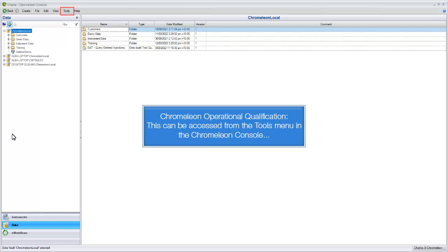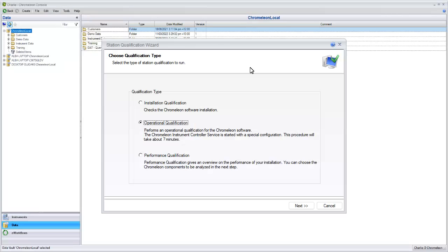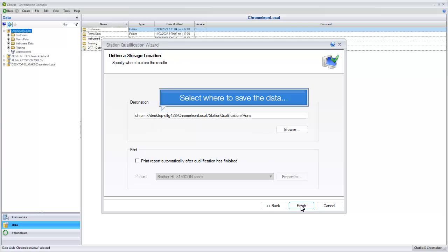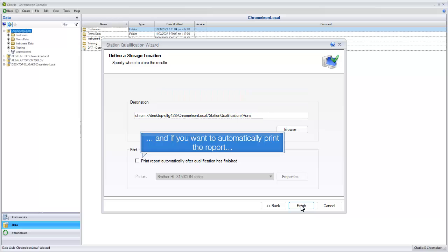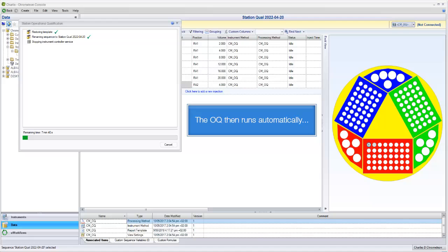Chromeleon Operational Qualification can be accessed from the Tools menu in the Chromeleon console. Select where to save the data and if you want to automatically print the report. The OQ then runs automatically.